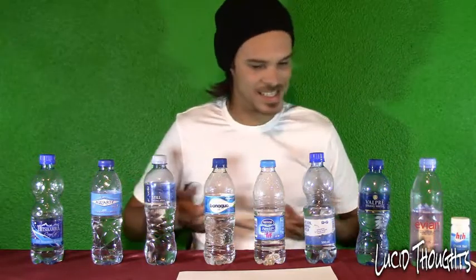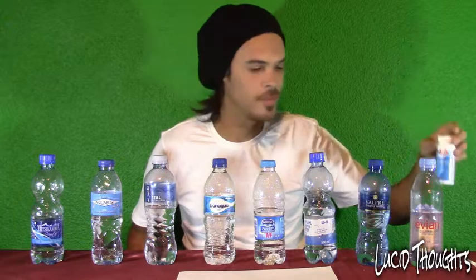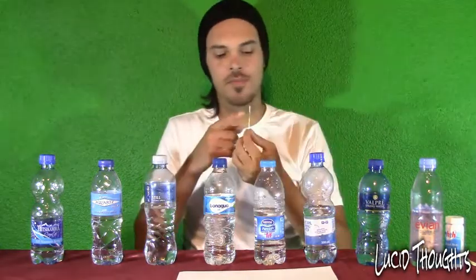We have eight types of water to test: normal tap water, boiled tap water, and water from my well. I bought this HTH quick test — it's for swimming pools but it works on water. I filmed this yesterday and messed it up because I didn't use it correctly, but now I know how. We're going to check the three top parameters: chlorine, pH level, and alkaline.